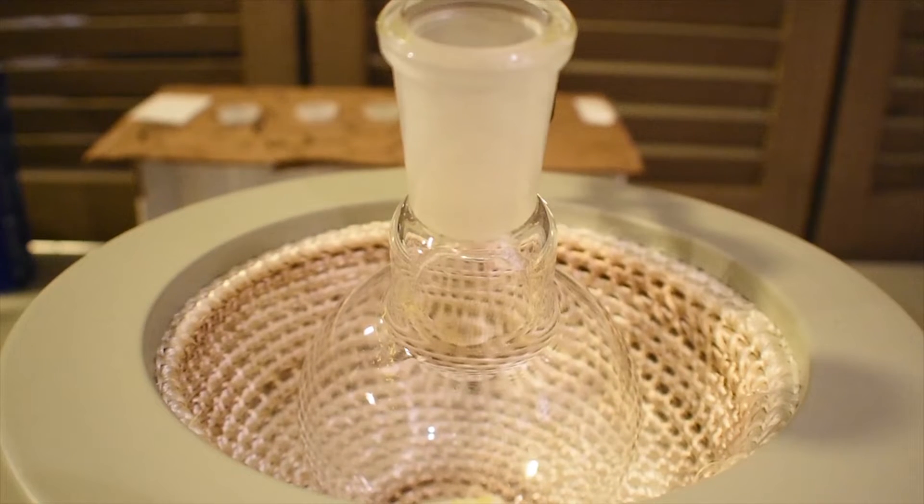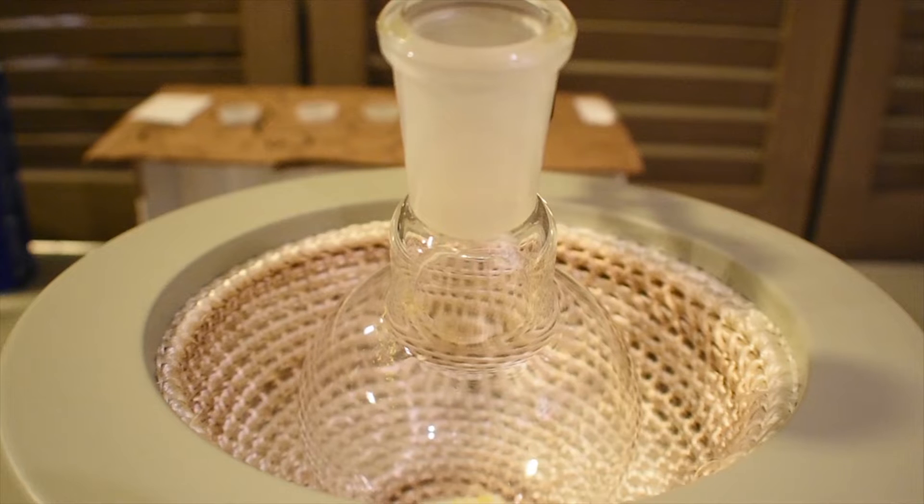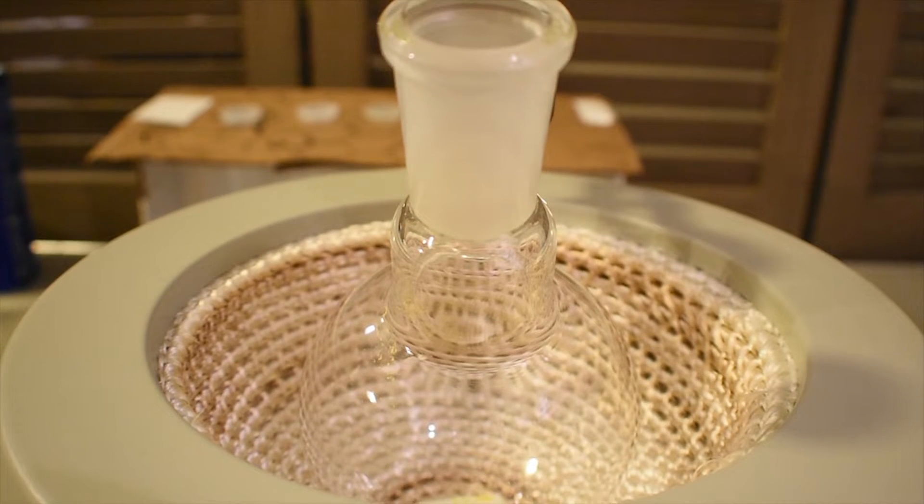After you've weighed out all of your materials, go ahead and load them into a — I'm using a 250 milliliter round bottom flask. You only need to add the Vanadium Pentoxide, water, ethanol, and sulfuric acid. Do not add the acetylacetone or sodium carbonate yet.